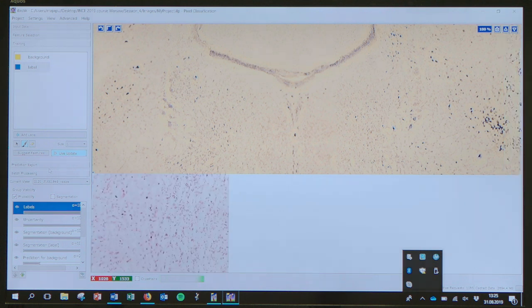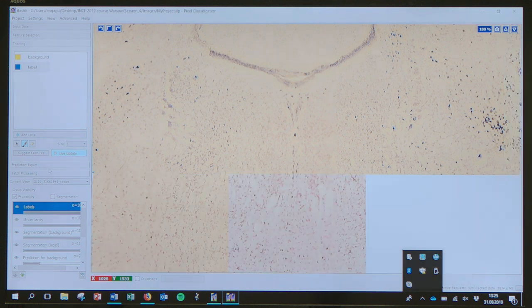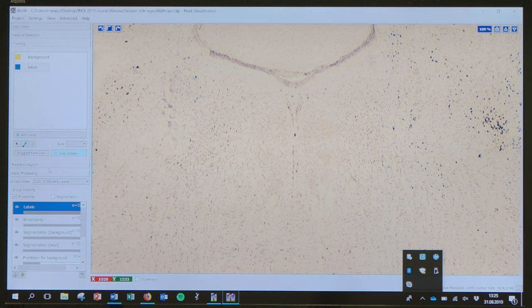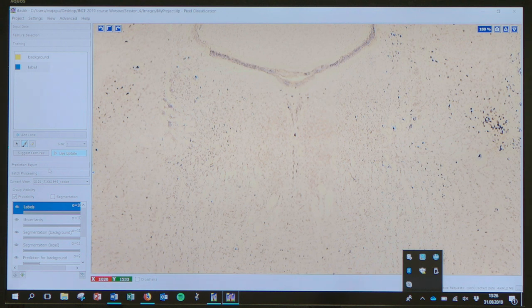These images I've uploaded are training images — a subset of a whole series. Then you can apply the classifier to hundreds of images and it'll export segmentations automatically. You can leave it running overnight and get the output for everything.